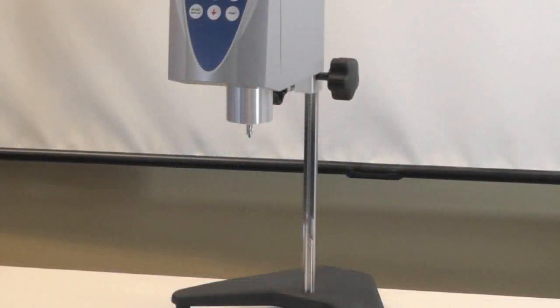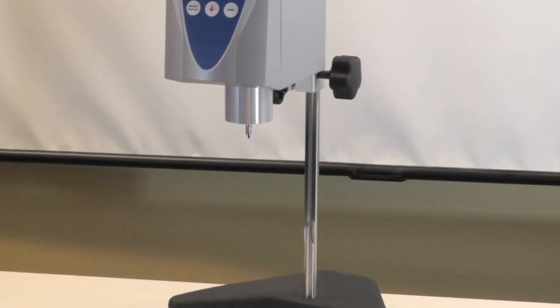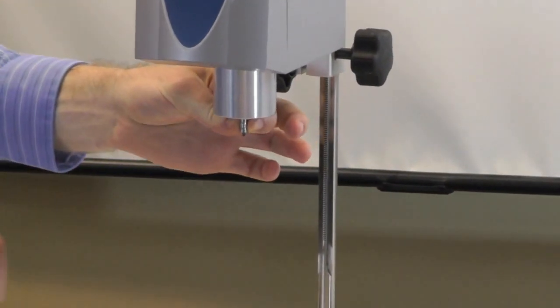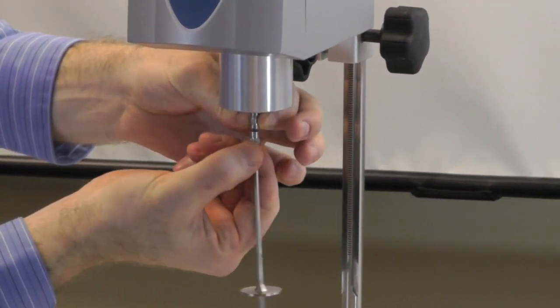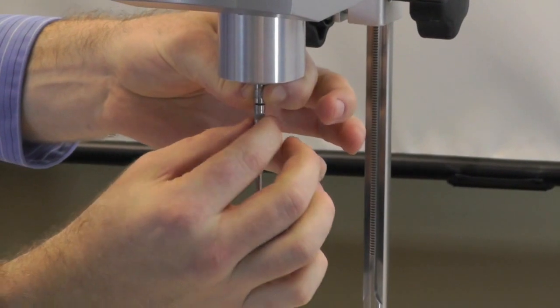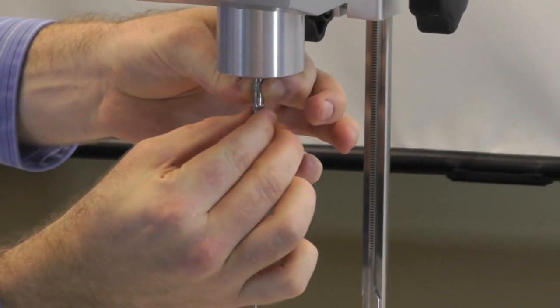Traditionally, in order to attach a spindle or chuck assembly to your viscometer, you would need to carefully lift up on the coupling nut with one hand, find the left-handed thread with the other hand, and screw on the spindle while keeping the coupling nut elevated.